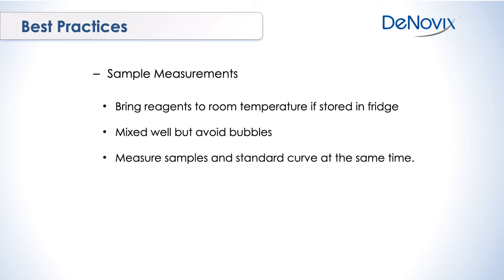Make sure you measure the samples and the standard curve at the same time. Now, a lot of software, including our software, will give you the option to save a standard curve and reuse it at a later date. We always strongly recommend that people don't do this.